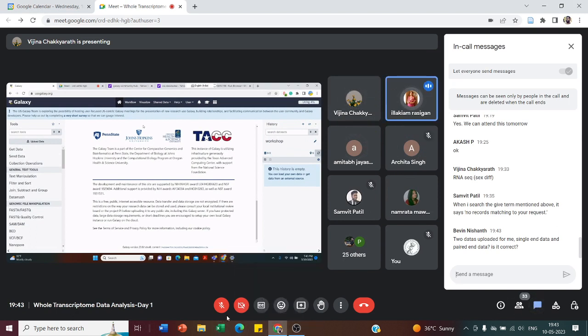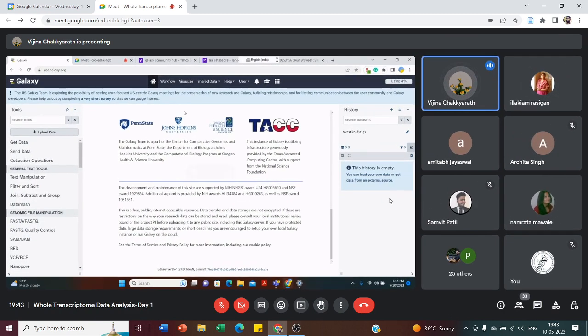Ma'am, please tell me how to name that one. Name the folder? How to name that folder? Control versus deleted, you have mentioned, no, ma'am? That history lane here. Here you can see edit, because I already named it here, so the edit option will come like this.